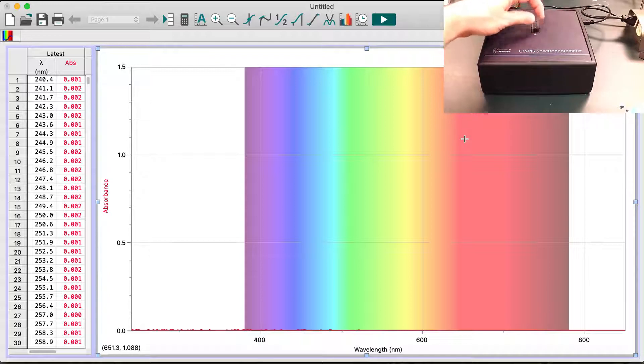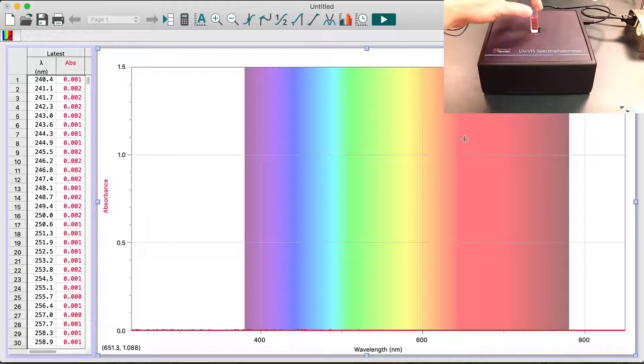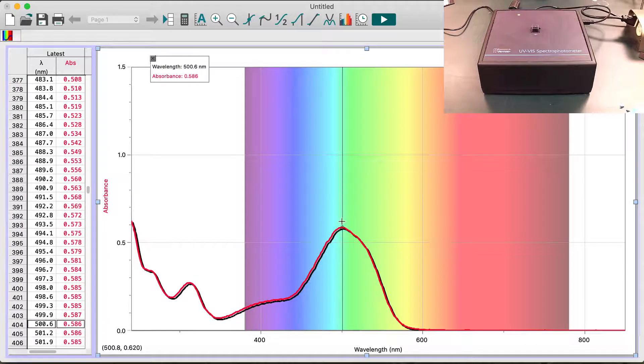Now we'll take a cuvette that has a sample in it and start with the red food coloring dye. This is Red 40 — I already have this ready and wiped off. On the software we say go and have it take the measurement. What you're looking at here is the absorbance at all the different wavelengths. The red line is really your data; it puts a black shadow under it so you can see the red line against the colored background. This shows us that the main absorbance peak for the red food coloring dye in the visible region is in the green, at about 500 nanometers. It's a broad peak so it's hard to get it precisely.